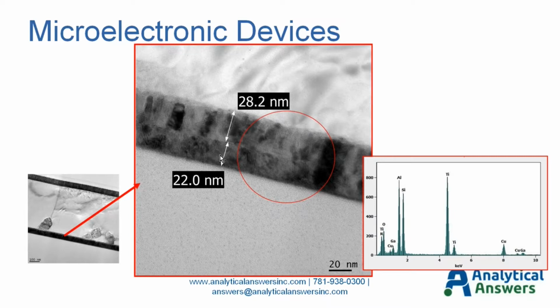So we're able to examine this particular region at very high magnification, and we can also do EDX work on that, which I've shown with this inset. The film below the aluminum then is identified as a titanium nitride. We see some aluminum from the metallization as well as silicon and oxygen from the dielectric. And we also see some extraneous peaks in the spectrum.